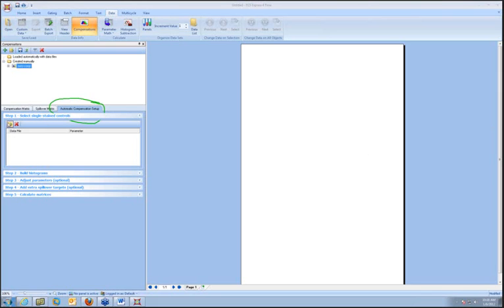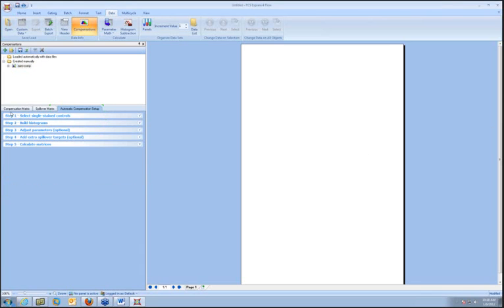So we've organized it as in a handy step-by-step approach. Steps 1 and 2 are mandatory to go through, and step 5. Step 3 and 4 are optional steps that allow you to do some fine-tuning. So what I'm going to do is go through the mandatory steps first and just show you how quickly you can set up your compensation, and then I'll show some more advanced features showing how to fine-tune it in different ways if you want to.